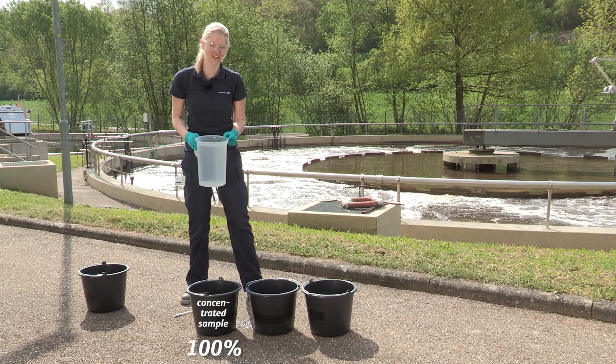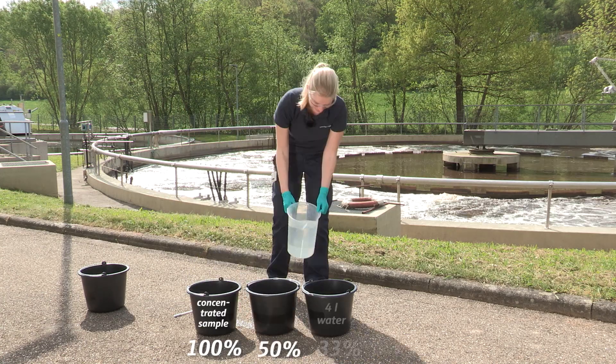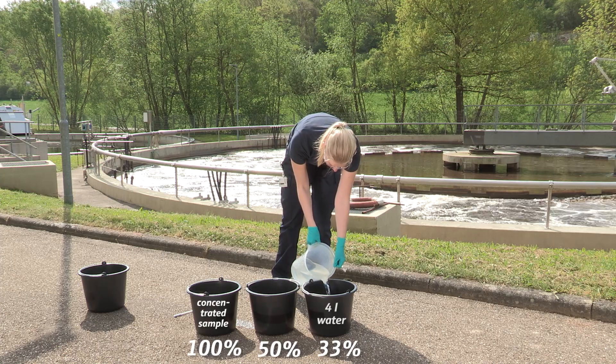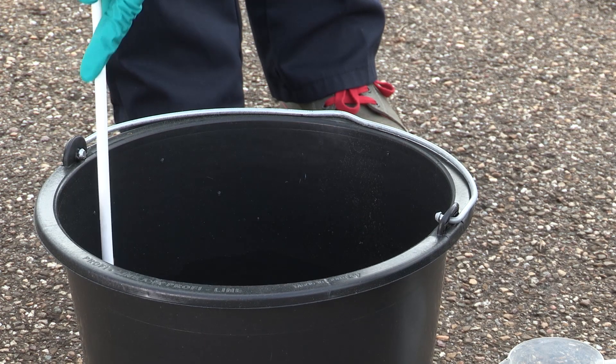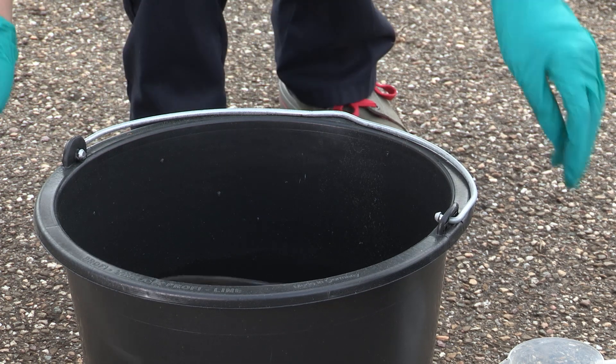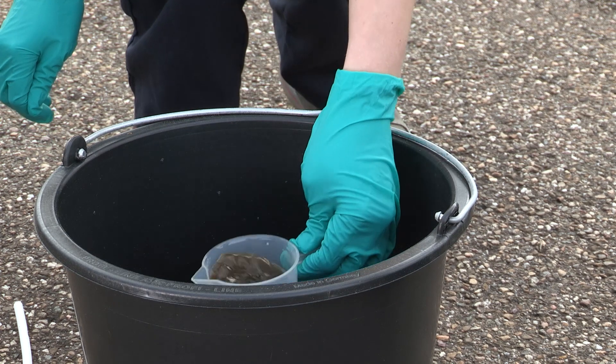For the dilution, we can use tap water. We can use the concentration in the lab to determine the reference value.